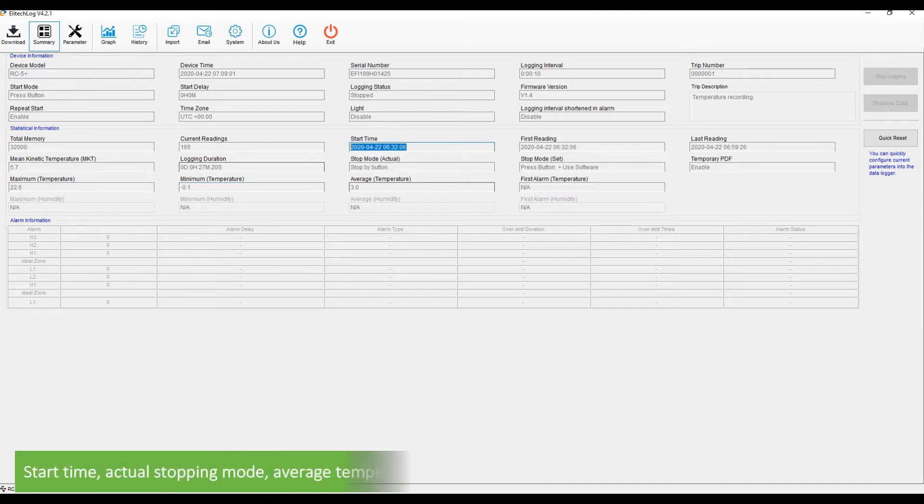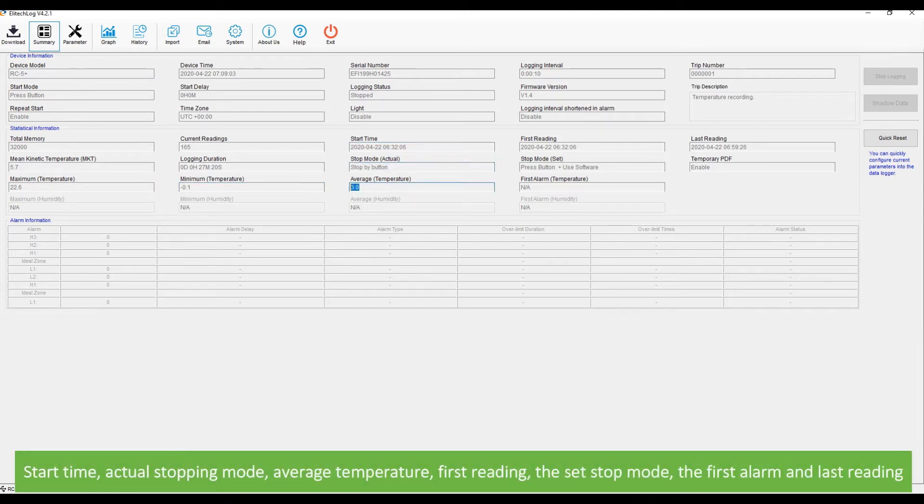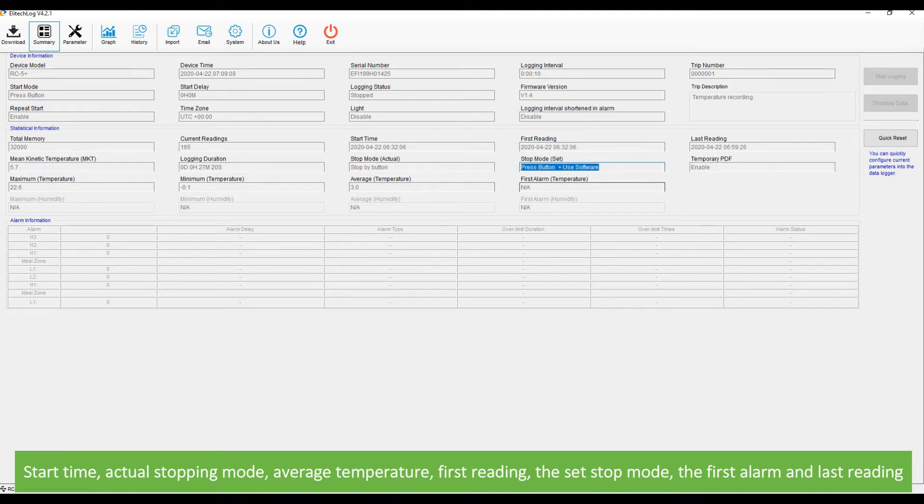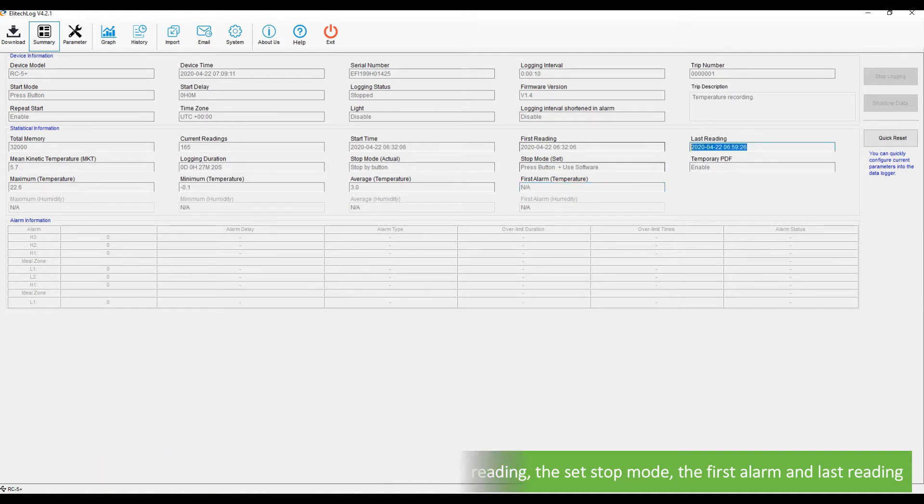Other data fields include start time, actual stopping time, average temperature, first reading, the set stop mode, the first alarm, and last reading.